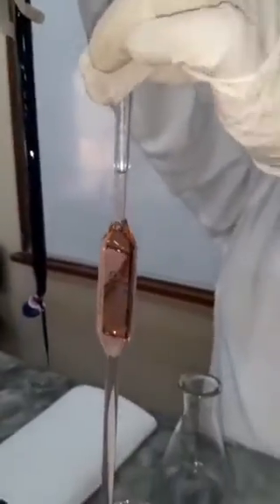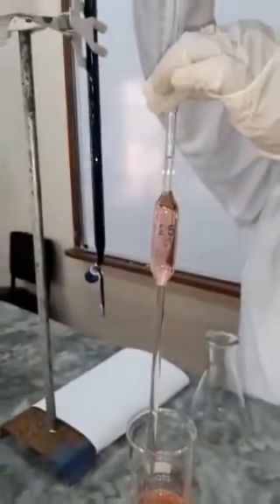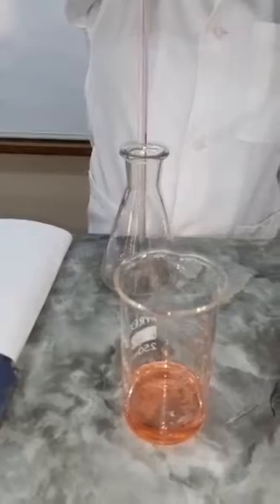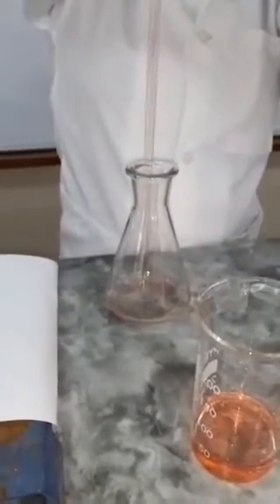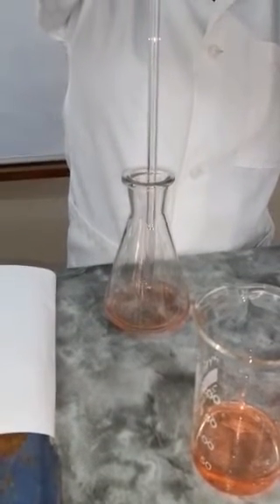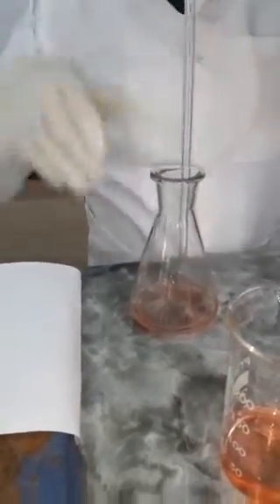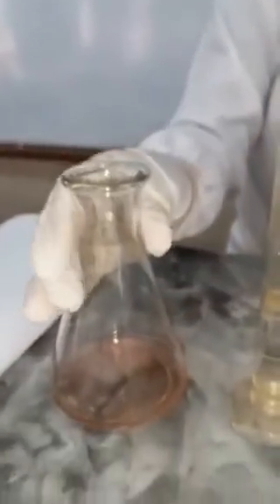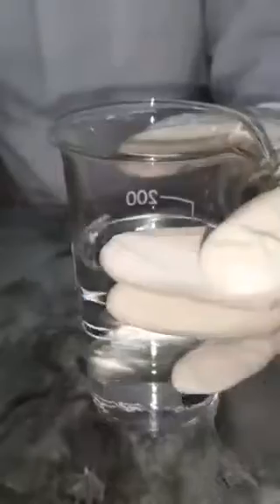So this is exactly 25 mL. Yes, then we transfer it into the conical flask. At this point now I'm going to pipette. But before I pipette, so before I proceed with the titration, I'm going to add 25 mL. This is 25 mL of 1 molar, sorry, of sulfuric acid.